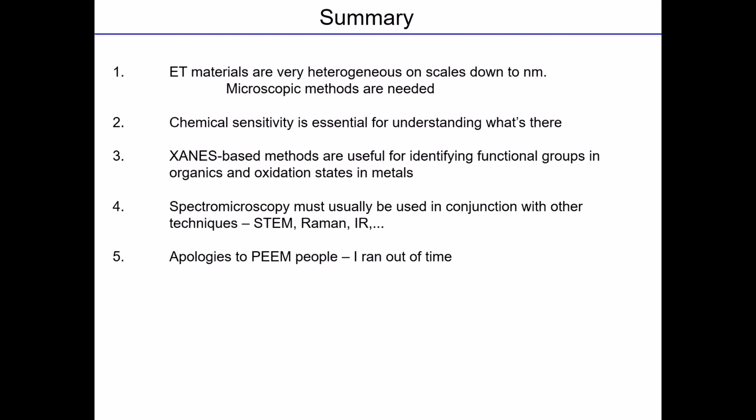The people who work on aerosols have solved some of that with some automated analysis. So there are papers where they show hundreds and hundreds of particles. I haven't talked to the meteorite and comet people much about it, but I would guess that the automated analysis and sample transfer will be very important.